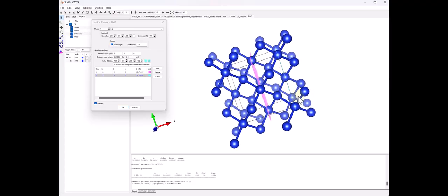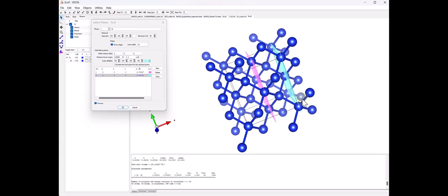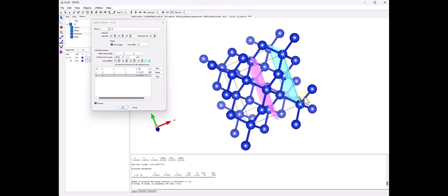This is a really helpful way to visualize, because it may not be completely intuitive the first few times that you're thinking about this, but the 200 plane is coincident with the 100 plane, which makes sense. So if this is the origin, here's 200, here's 100, but this distance from the origin to the first 200 is the same as moving another 200 distance in this plane. So the 200 is also the 100 plane, but the 100 plane is not the same as a 200 plane.